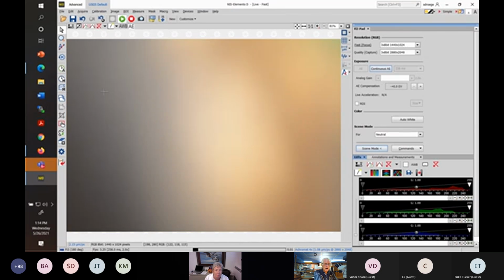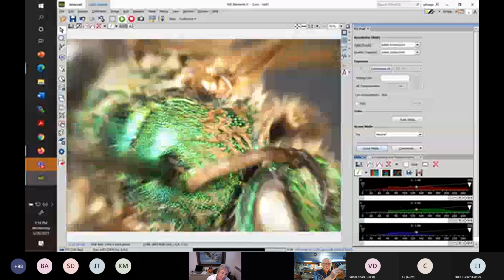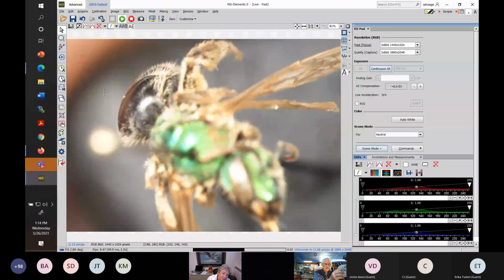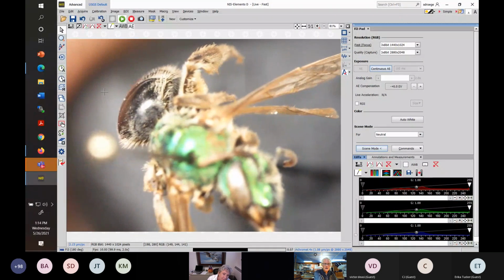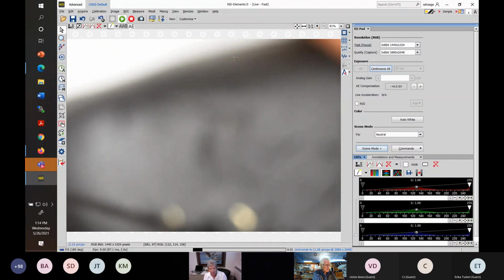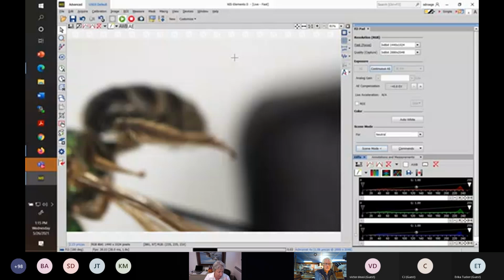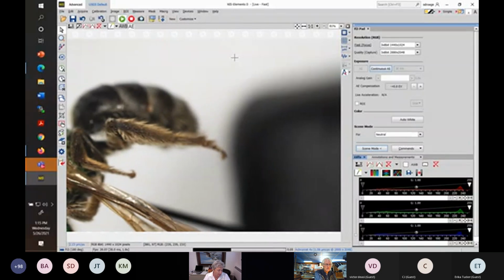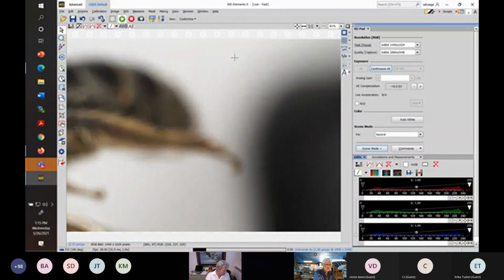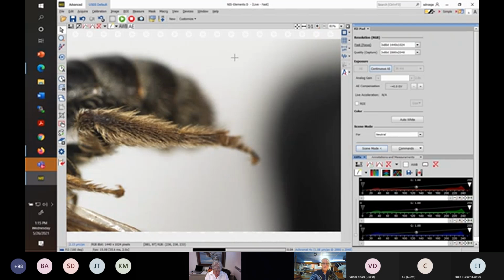Later, as you get more experience, you would just eyeball an Agapostemon and know it's a male or female based on the size and shape, and whether it's got pollen collecting hairs back here. There are pollen collecting hairs on this female or not. But surprisingly, we still spend quite a bit of time on some specimens that we're not very familiar with counting antennal segments. So it's the skill that lets you know. If there was a sting, it would be a female. If there were genitalia hanging out, it would be a male.